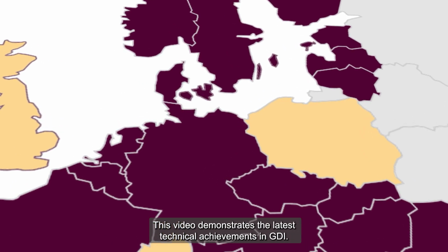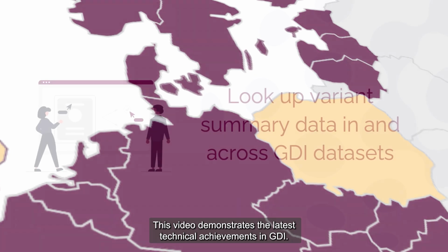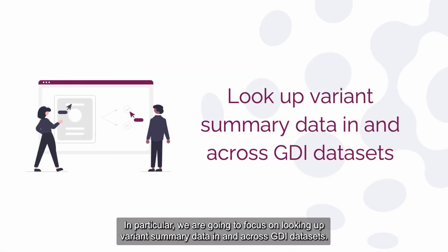This video demonstrates the latest technical achievements in GDI. In particular, we are going to focus on looking up variant summary data in and across GDI datasets.